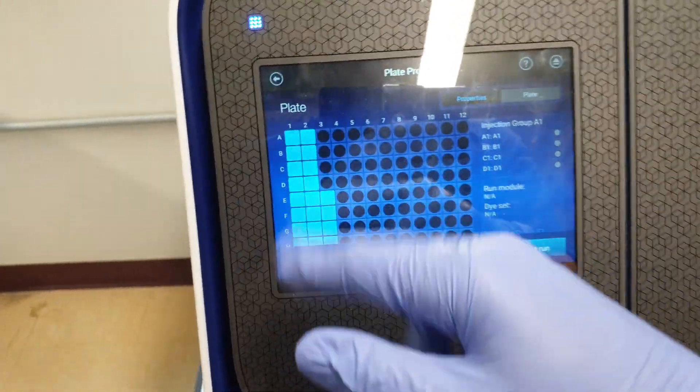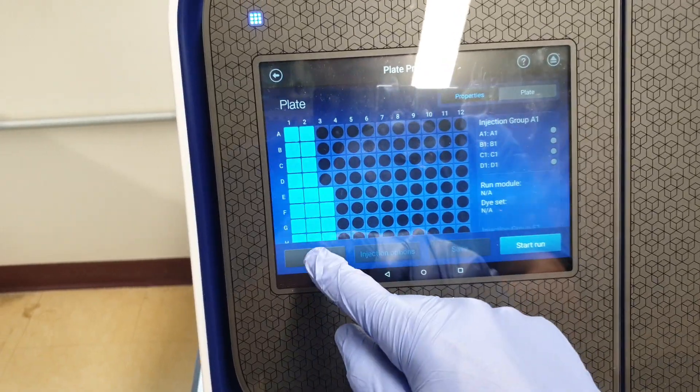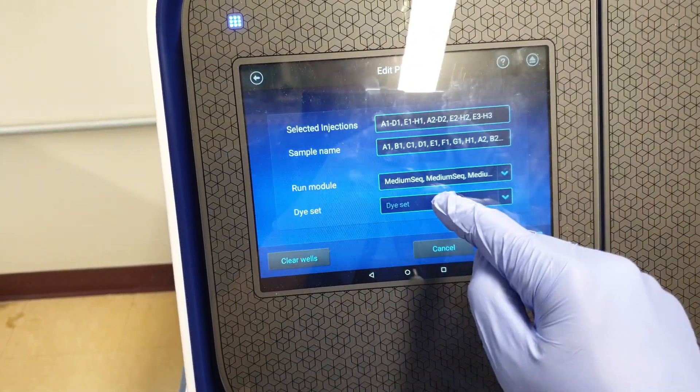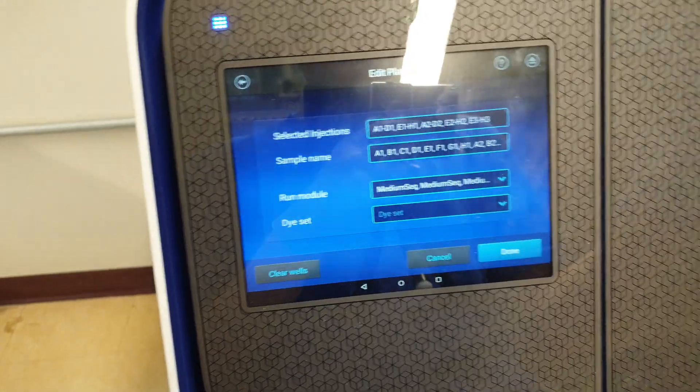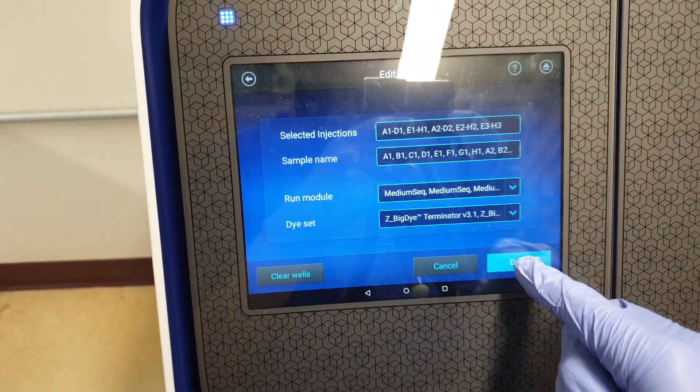These are the spots that are filled with DNA already. Click on Edit Run Module Medium, because that's how much base barriers I'm going to be covering. 3.1. Done. We're going to click on Done.